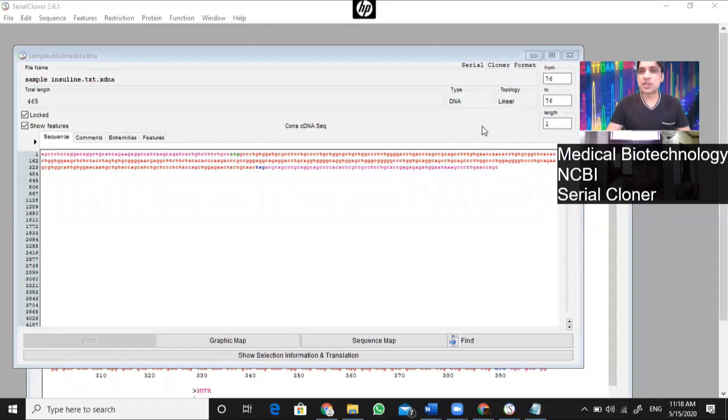Okay. First suggestion, I can see replace it. I have more suggestions. Sir, delete it. Other one, replace it, delete it. Two replace, two deletes. Even Steven. I just want one more casting vote. Delete it or replace it, because then you will do the rest yourself. Delete it. Okay, I got the vote. So let's delete base pair number 76.